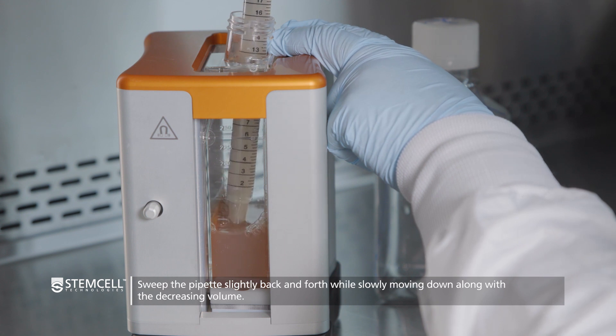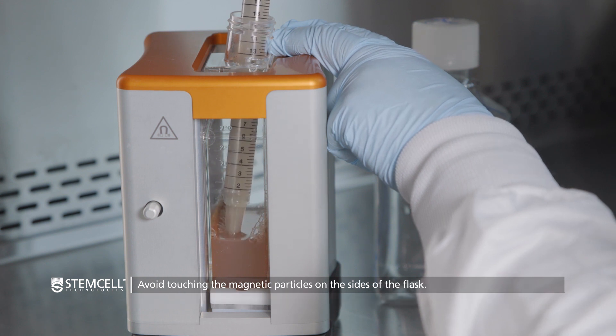Sweep the pipette slightly back and forth inside the flask while slowly moving down with the decreasing volume of the supernatant. Take care to avoid touching the magnetic particles on the sides of the flask.